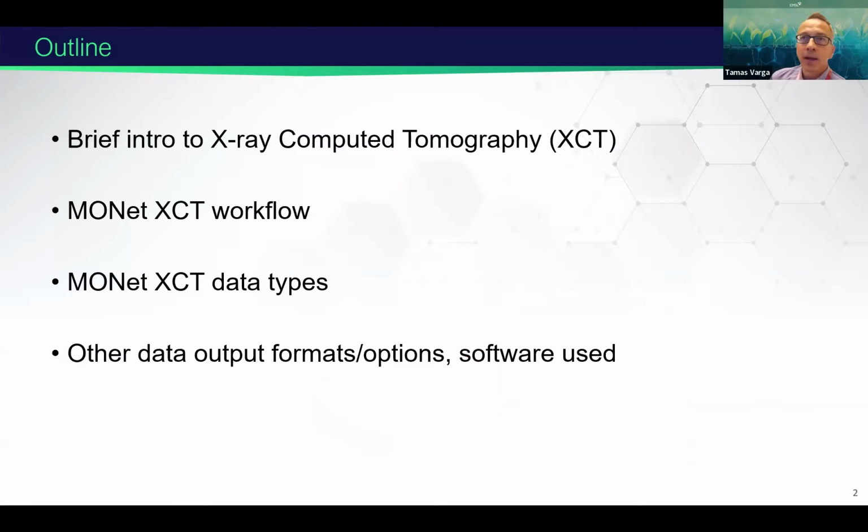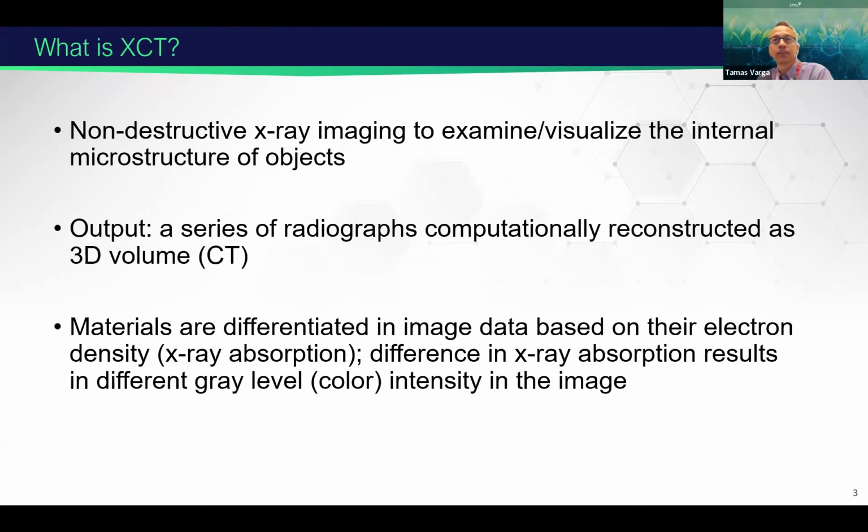Hope it sounds good. So my agenda is to provide a brief overview or intro into X-ray computed tomography, or XCT, then talk a bit about the MONet-specific XCT workflow and what the data types are, and then some other optional output formats and some software tools that can be used to view or analyze the data.